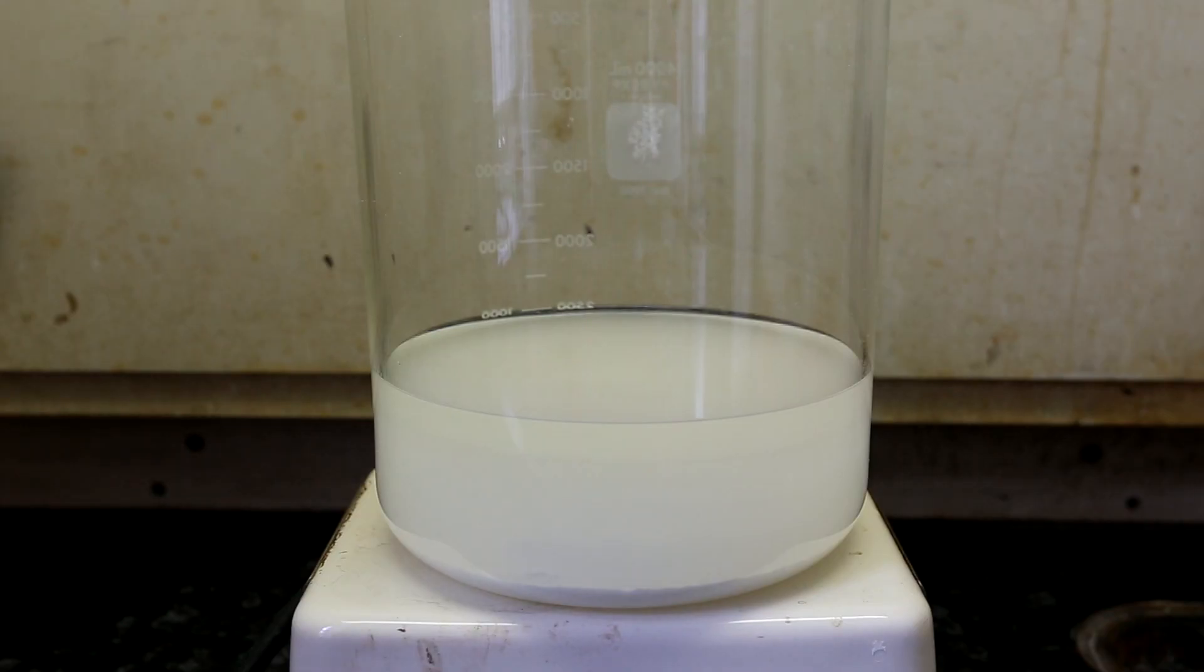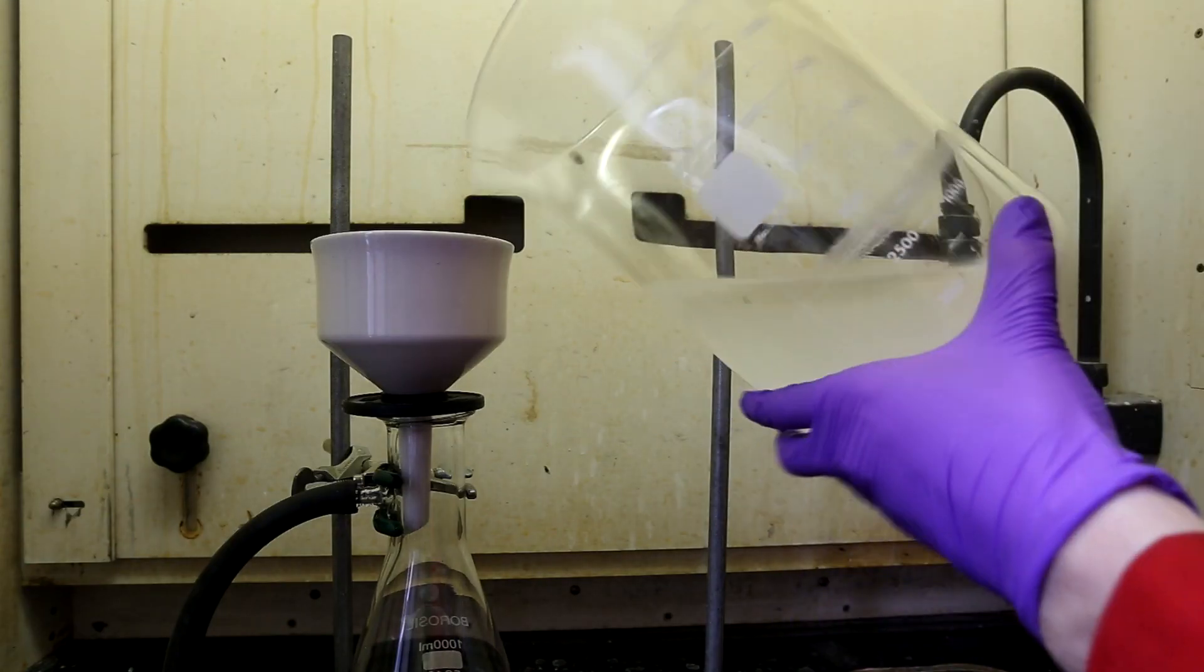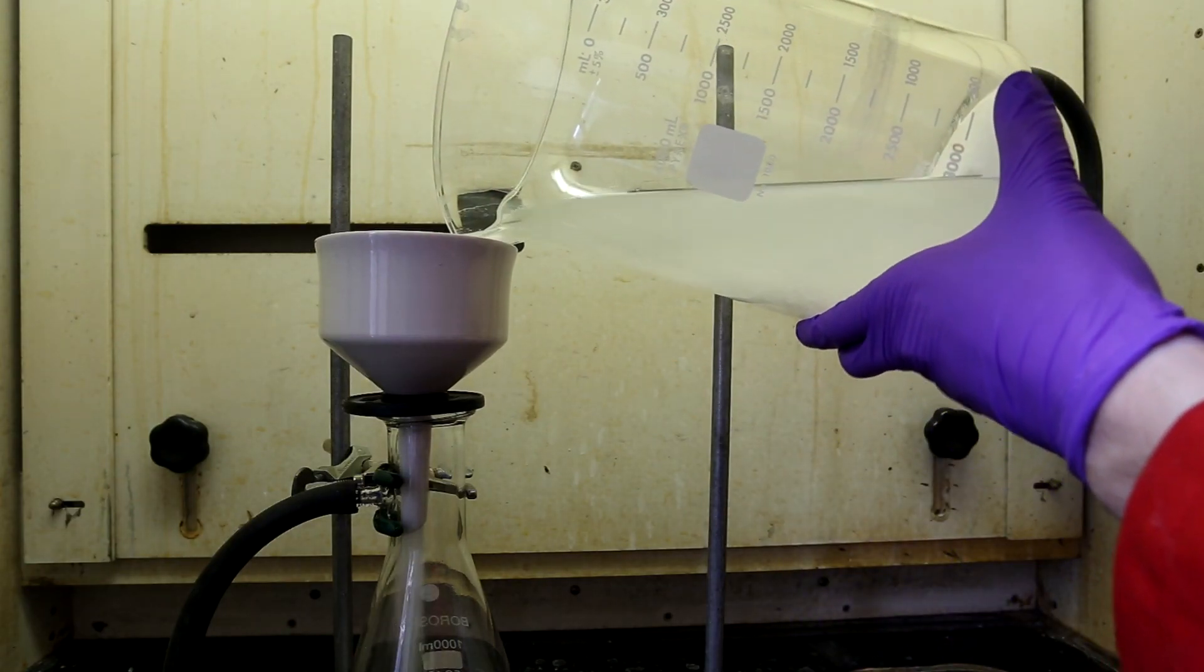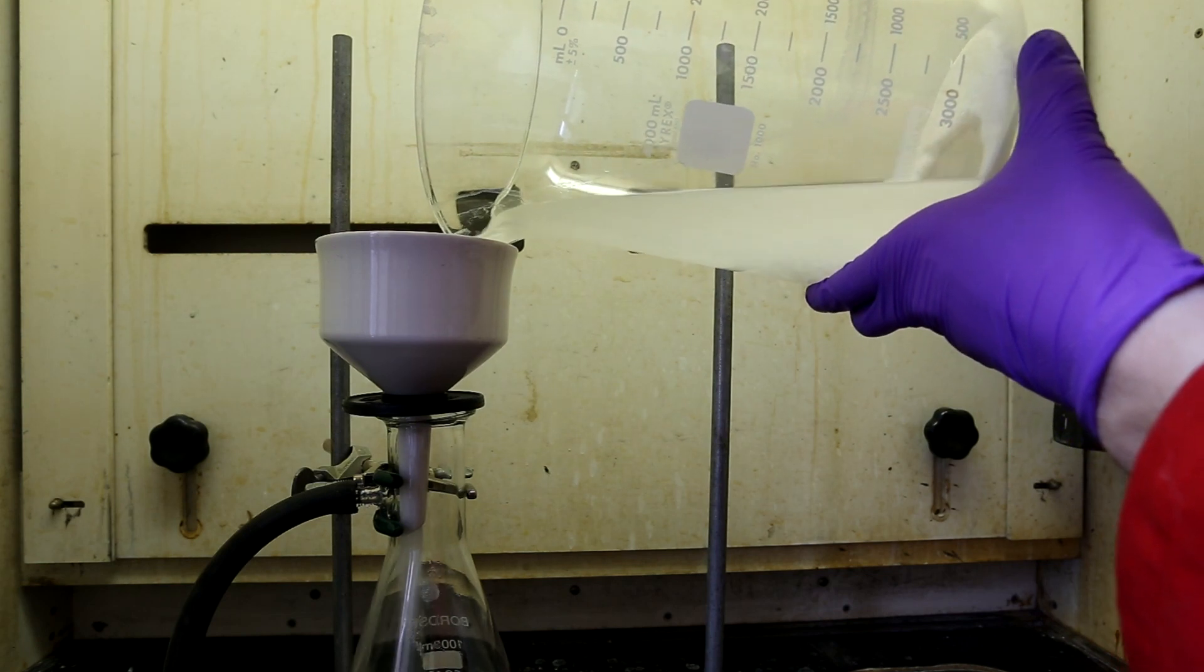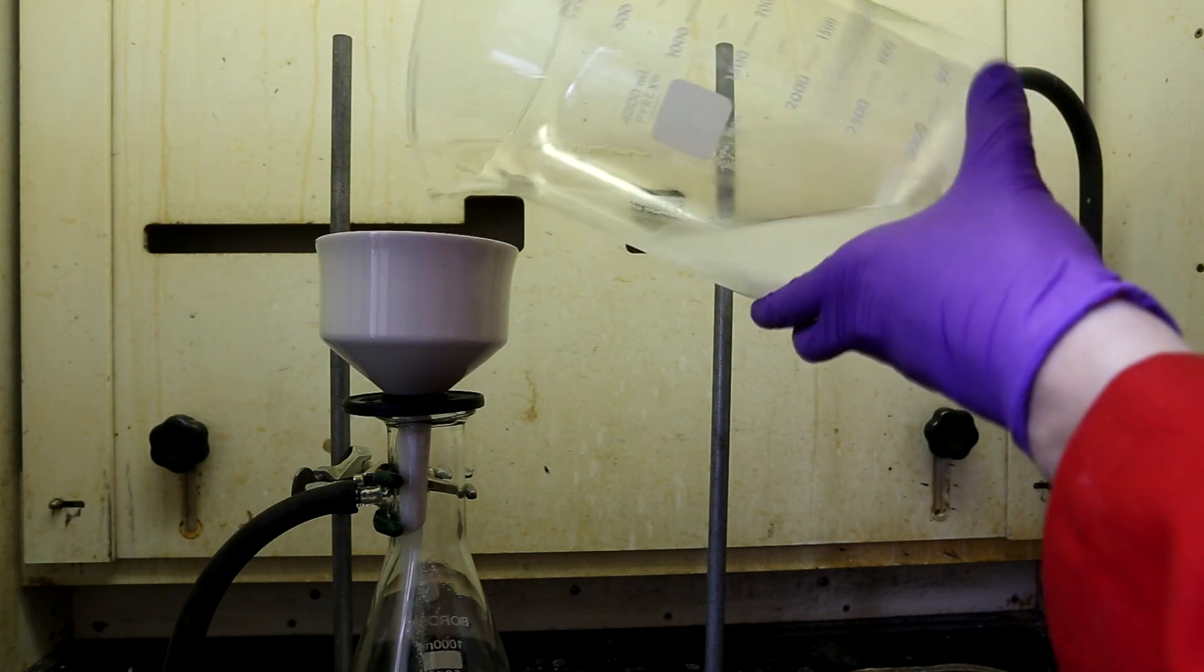I let the solution stand for about an hour to let a lot of the starch and cellulose sink to the bottom. I then vacuum filtered the solution and I washed the starch cellulose solid twice with 100 milliliters of acetone.